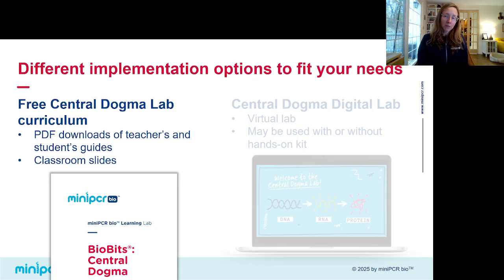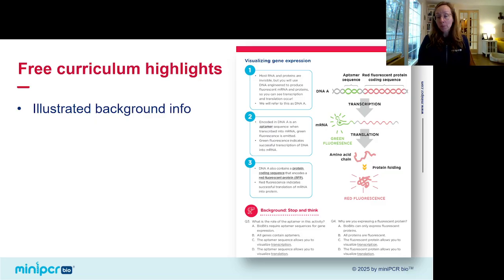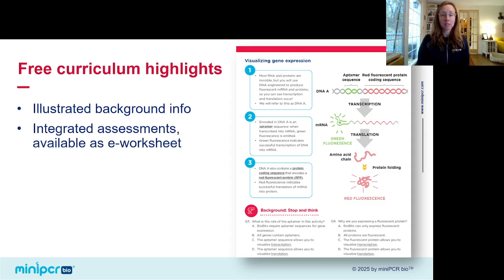The curriculum for this lab, as I mentioned, is free, so you can go to our website and download the teachers and students guides. This is one sample of one page from our students guide. This is a visual lab guide, so what we do is we try to convey as much information as possible through diagrams with brief bulleted captions. There are assessment questions interspersed throughout, and those are also available as an e-worksheet that you can integrate with your LMS.